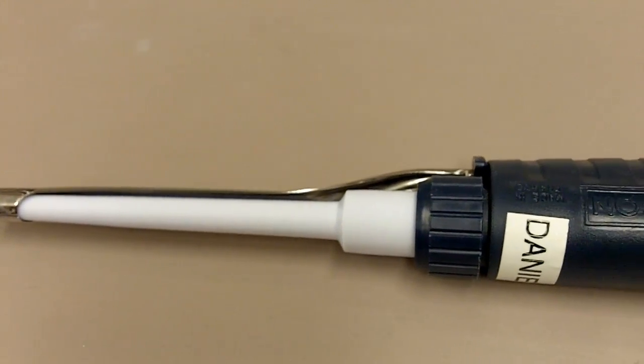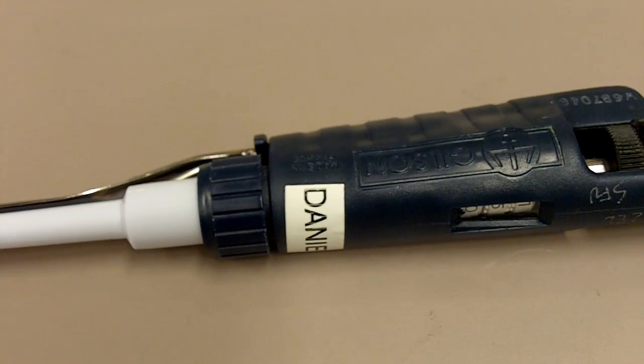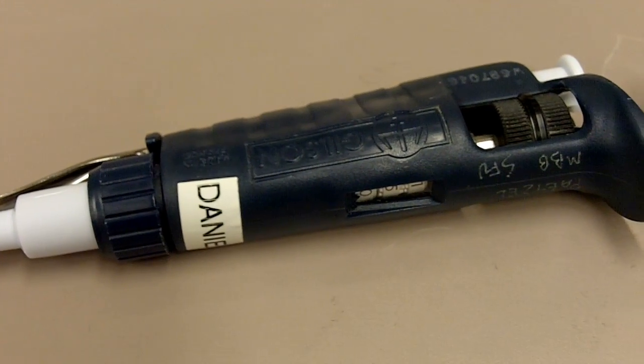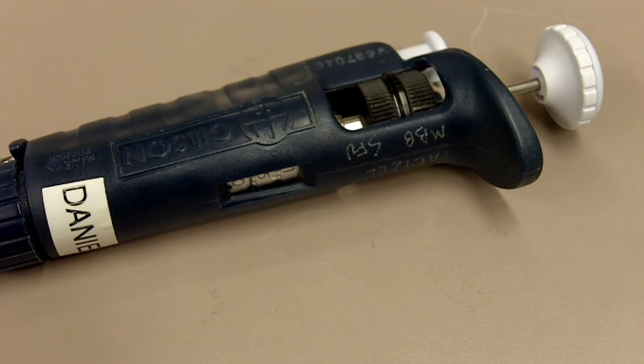So this is a pipette. It's also known as a micropipette because it's used to withdraw small volumes in a microliter range. I'm going to walk you through the basics of a pipette.